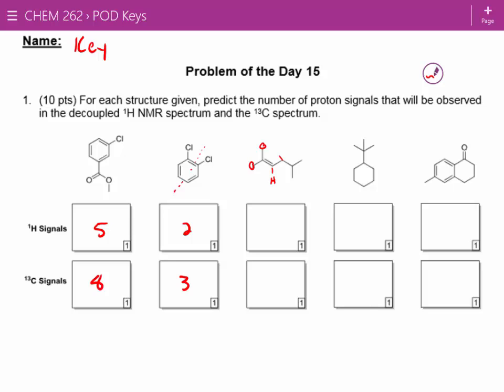What about these protons here? Are they the same or are they different? One has a double bond and the other's not. It's important to remember that they're not pointed like that. One's actually more of a wedge, the other one's a dash.